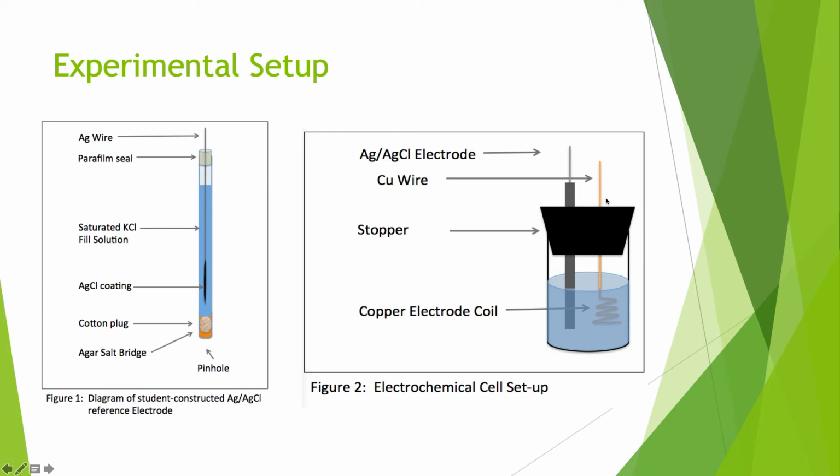You're going to have a copper wire that you just hang through, and you can bend the top of it over at a right angle, so it'll just hang there nicely. And just make sure your copper wire and your glass tube are down in your copper solution for your different parts of the experiment, because it's this solution down here that'll change for your two parts of the experiment. But you'll add your copper sulfate solution here for part 1.